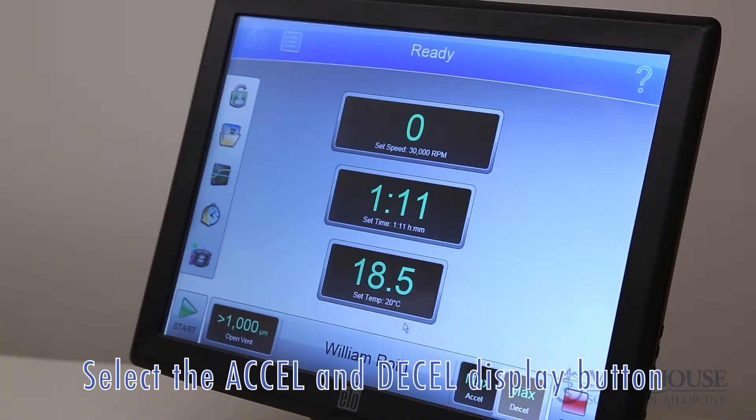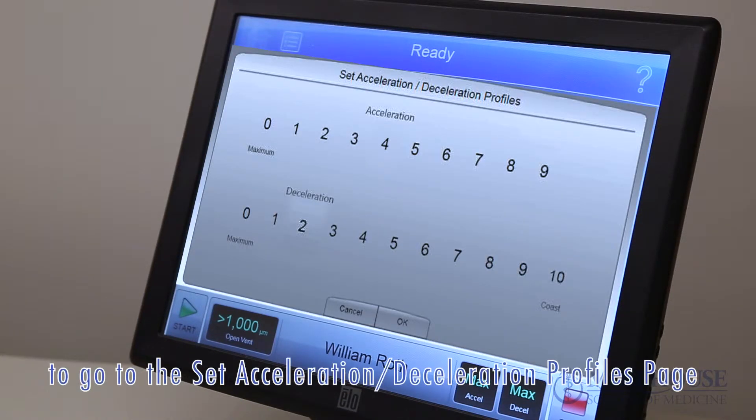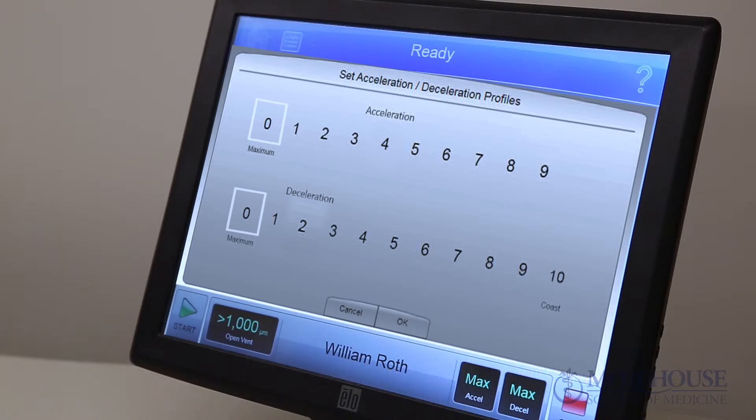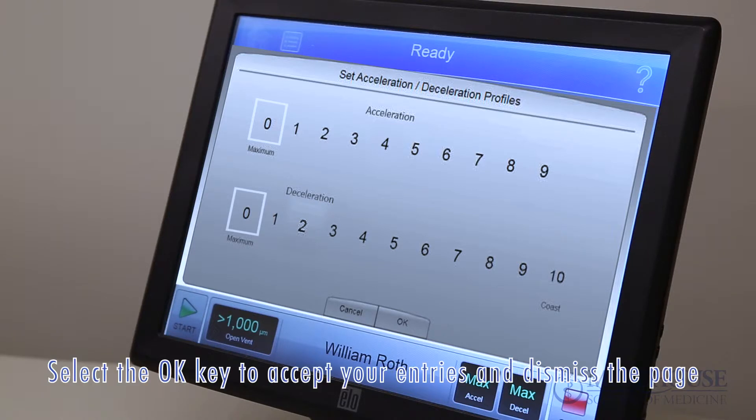Select the accel and decel display button to go to the set acceleration deceleration profiles page. Select the desired acceleration and deceleration profiles, then select the OK key to accept your entries and dismiss the page.